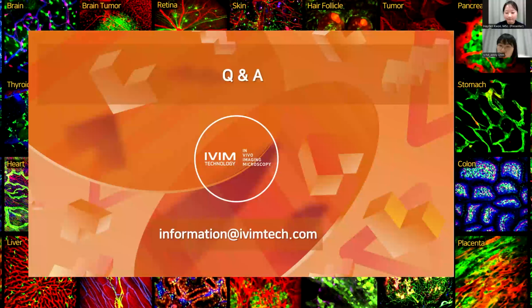And our last question is, how long are you able to continuously image in the kidney or lung? How do you do the longitudinal imaging over 11 days? In terms of the kidney, we could utilize two surgical methods. First, you could repeatedly open and close the skin at every time point for kidney imaging.